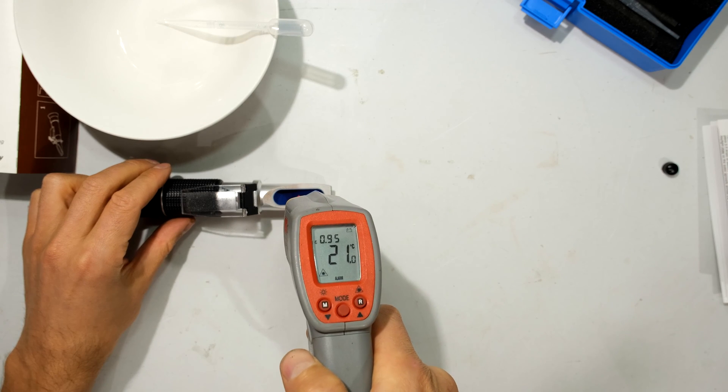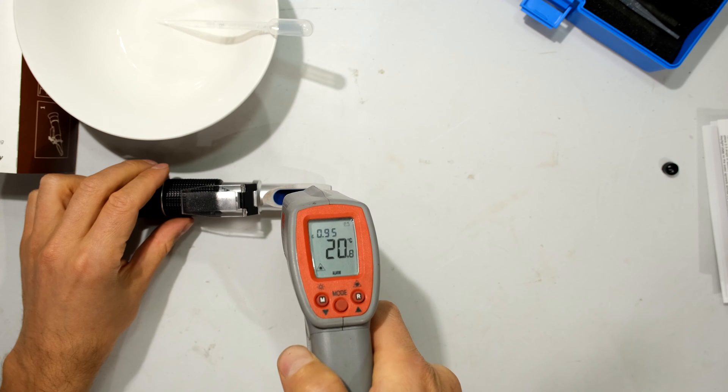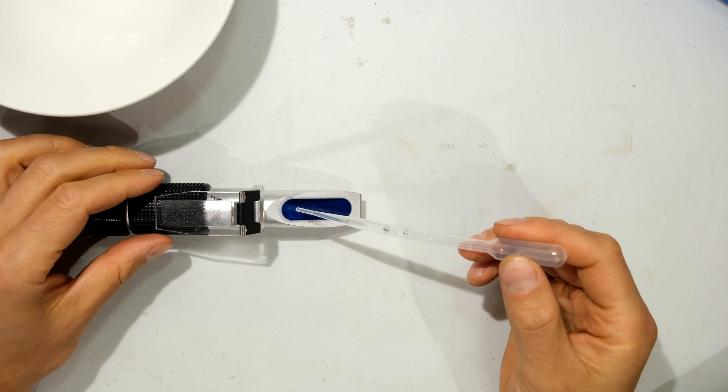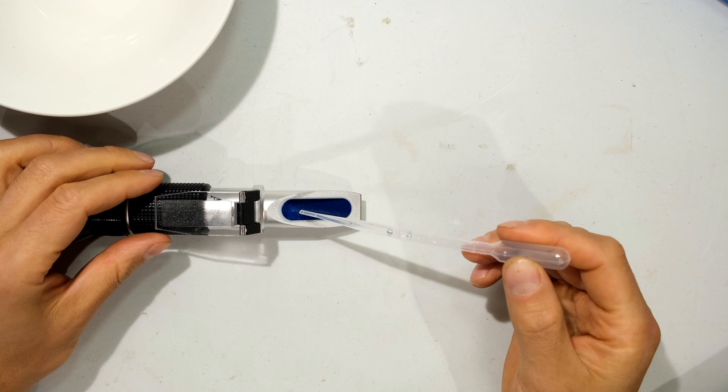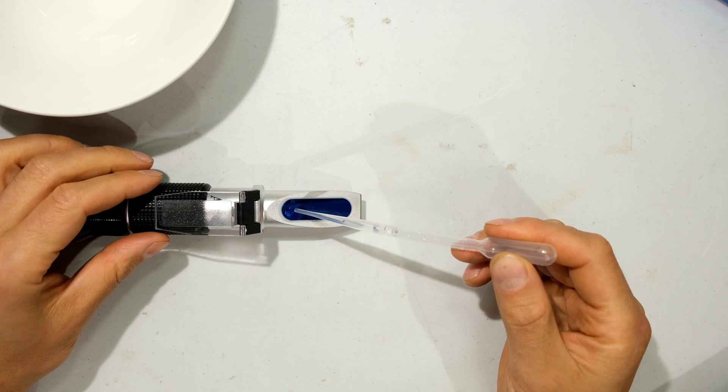Right, and just checking the temperature of the prism, you can see that it is 20 degrees centigrade. Now take one to two drops of the distilled water and put it on the prism.